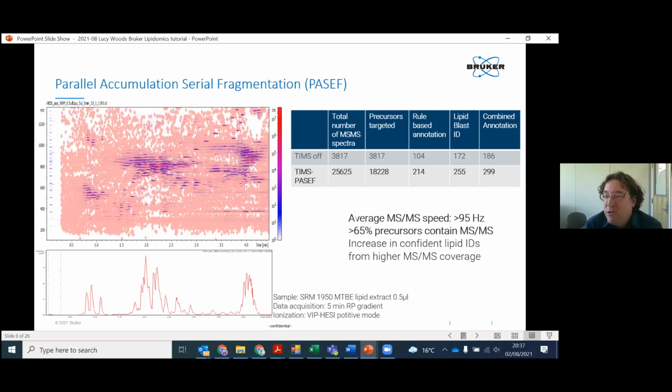Yeah, I'm just saying that this is the obvious next step. Not just naming a compound, but also saying, well, I'm 99.999% sure, or maybe 95.7% sure, because there could be an overlap in CCS and so on with an alternative explanation of my data. Yes, good point. Like a score for protein identification, like a Mascot score, something like that.